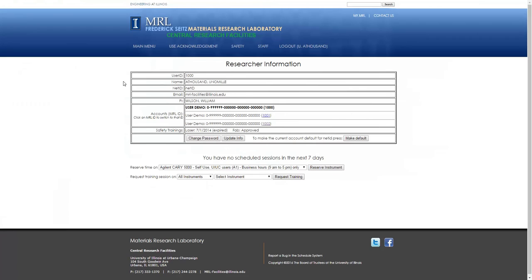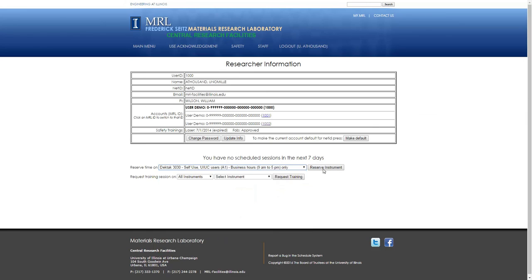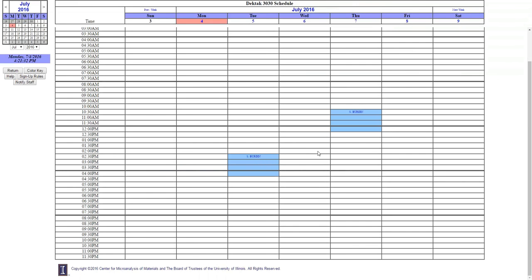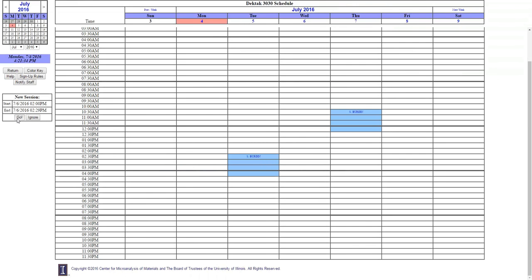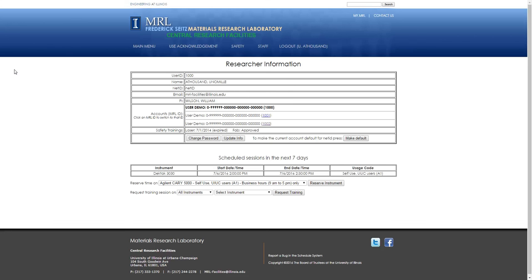So let's return to the schedule system. Now, I didn't actually sign up for any time there, so I'll just sign up for half an hour here. And then click Go. So that you can see, it will now appear here. This will tell you about all the upcoming sessions in the next week, counting today.